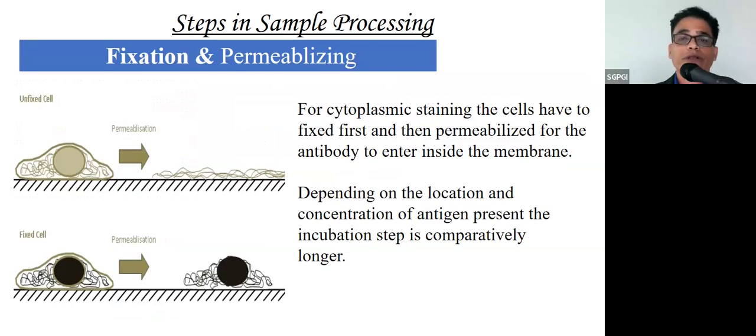The third step comes under cytoplasmic staining. You have lineage-specific markers like anti-MPO, which has to be processed as cytoplasmic, anti-MPO, cytoplasmic CD79a, cytoplasmic CD3 in T-ALL basically. Apart from that, you have Ki67. We are doing NPM1 also, TdT also. We are dealing with some different cytoplasmic markers. For that, you need fixation and permeabilization. This again is going to happen in two steps.